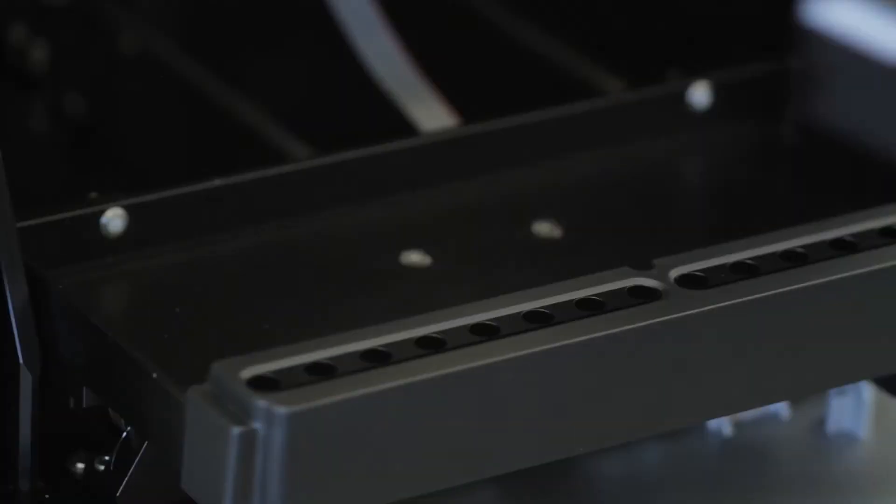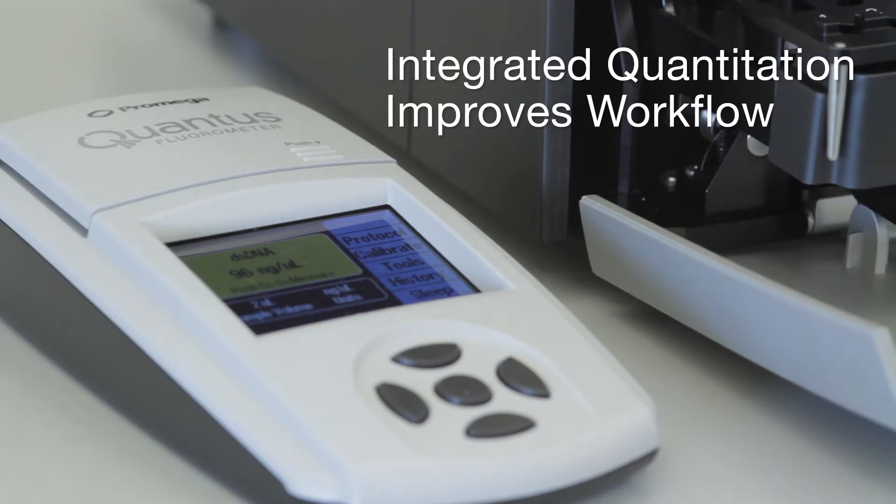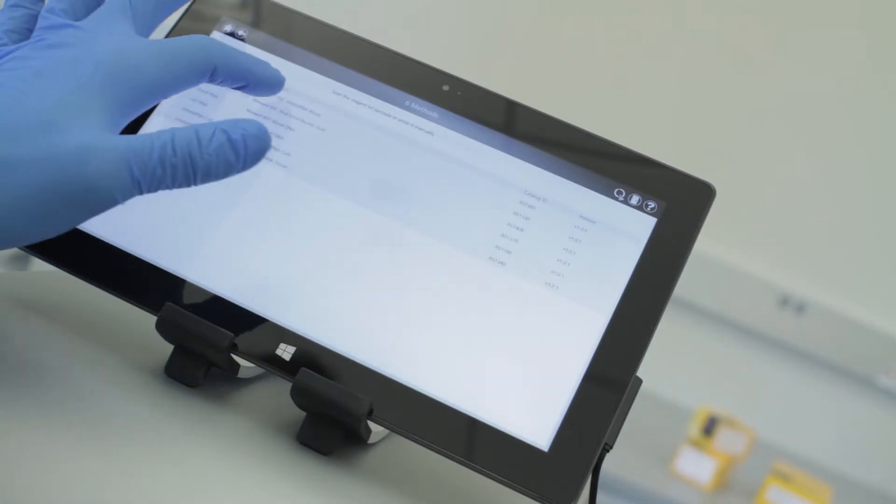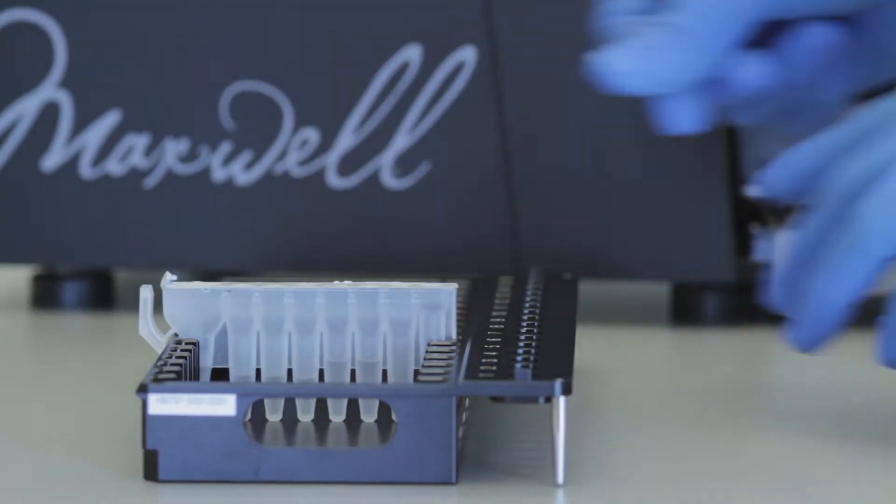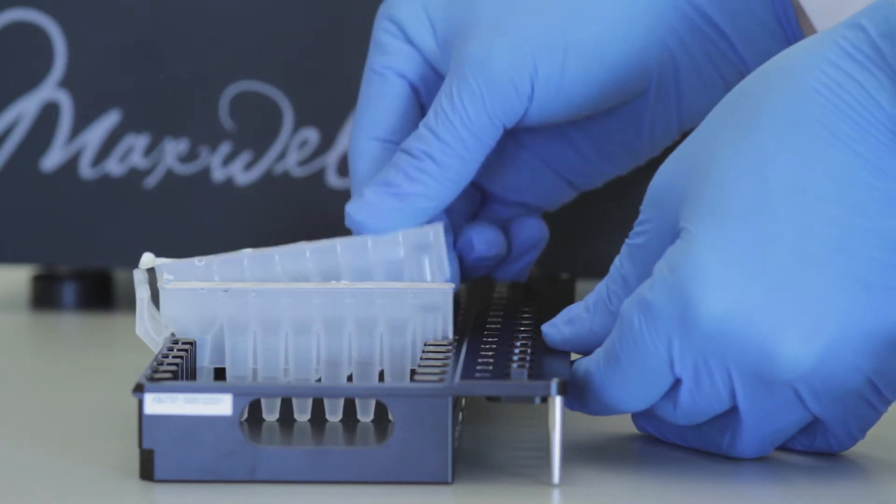Automated purification saves you time, and integrated quantitation means that all of your results are kept together. Pre-programmed methods and pre-filled reagent cartridges get your samples processed quickly and help you get more done.